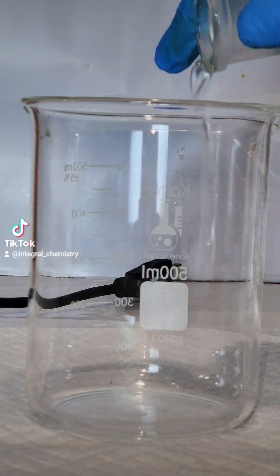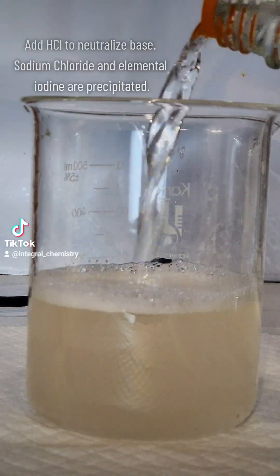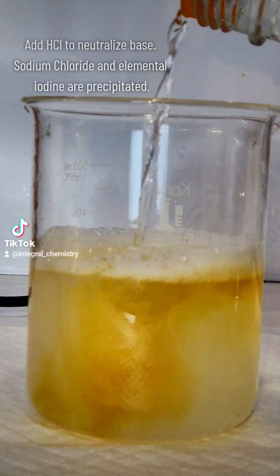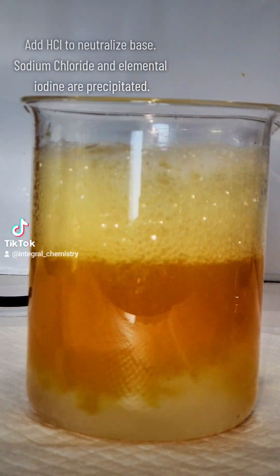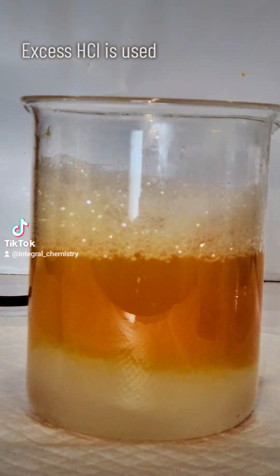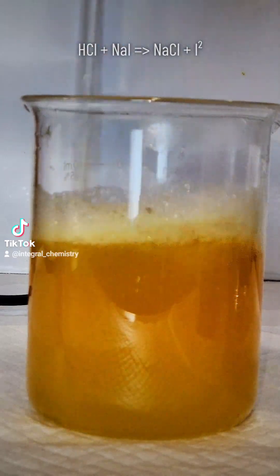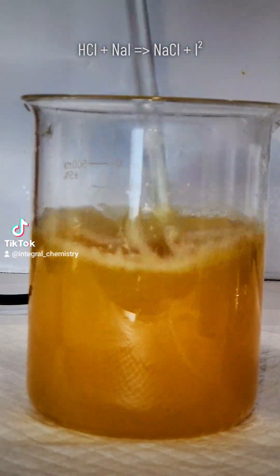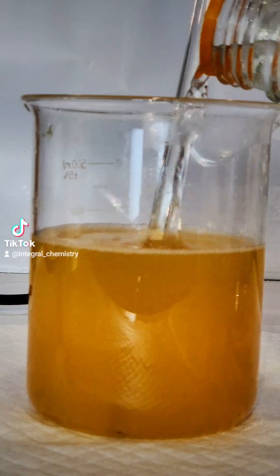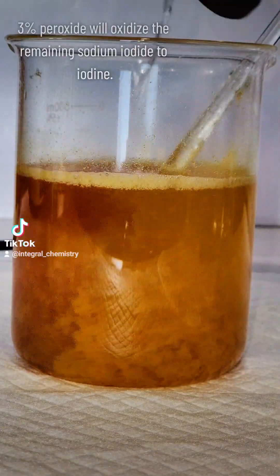Once I finally reach my target volume, I pour my solution off into a 500 milliliter beaker. To this, I'm going to add hydrochloric acid, which will neutralize all of my excess sodium hydroxide. It'll also react with the sodium iodide to form sodium chloride and elemental iodine. This reaction is highly exothermic and will release a lot of heat and potentially some foam, so make sure you do it in small amounts.